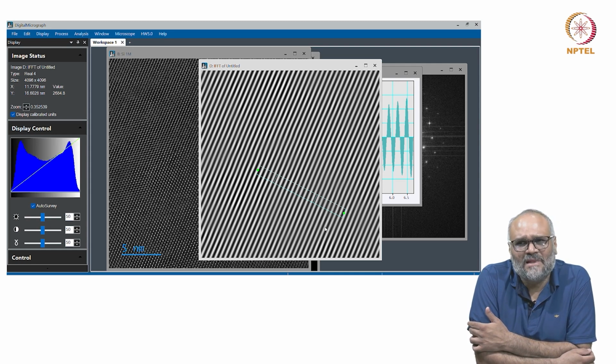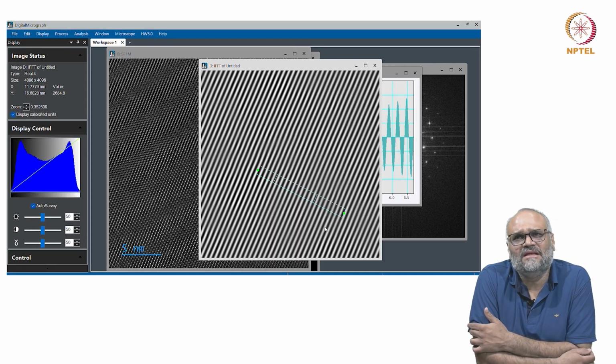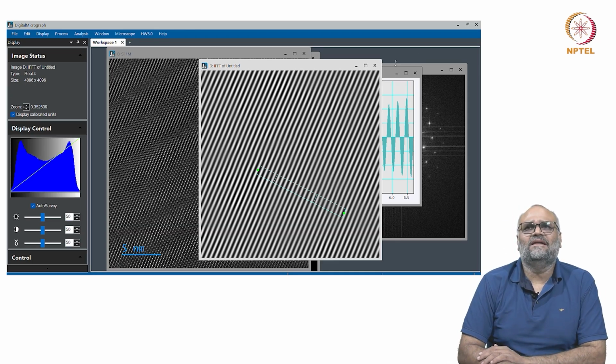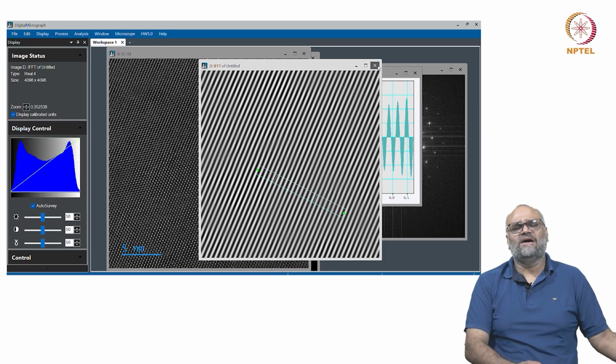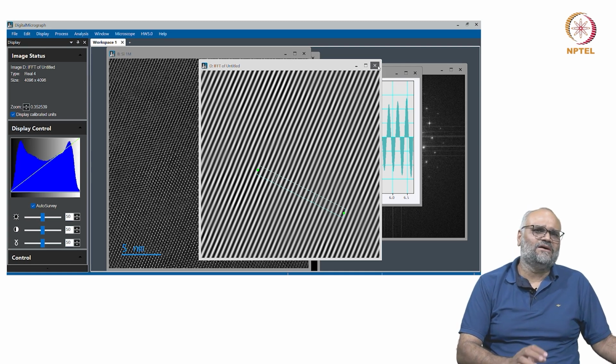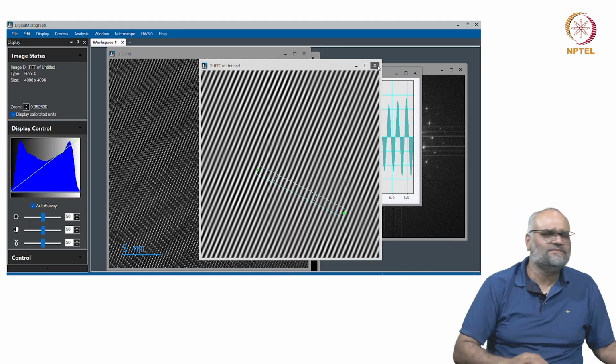More than the change in the magnification and the field of view that you are measuring, there is a greater likelihood that errors can come up when you are actually measuring by drawing lines. So this is one simple example, and let me show you a case where you can prepare some figures for a paper or a publication using some STEM data.